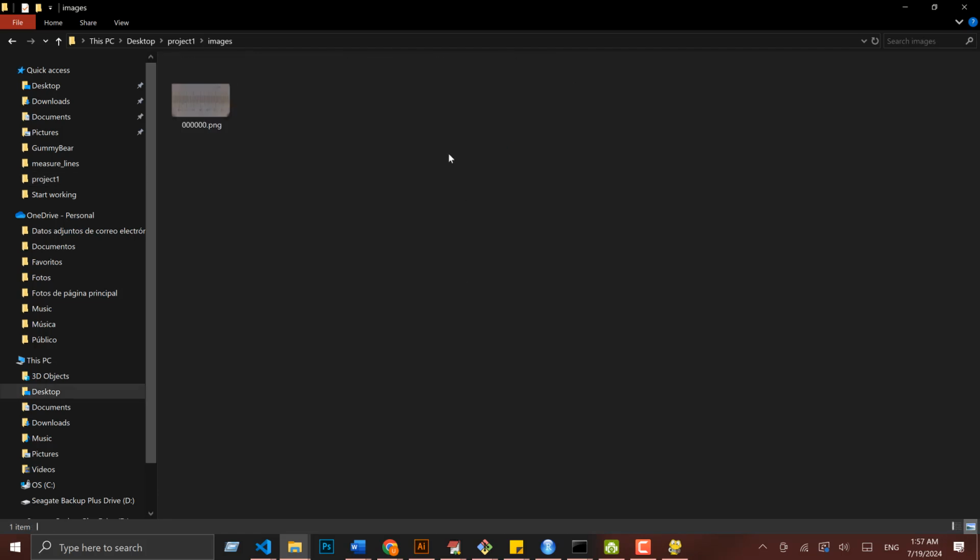I double click on it, and then I can find my image there. By default, the images are labeled with 6 digits. In future programs, depending on what the users require, I can create a version that will allow us to specify the name, the same name that you use with a measurement, to also be applied to the name of the image that you take. But I need to define the details first.